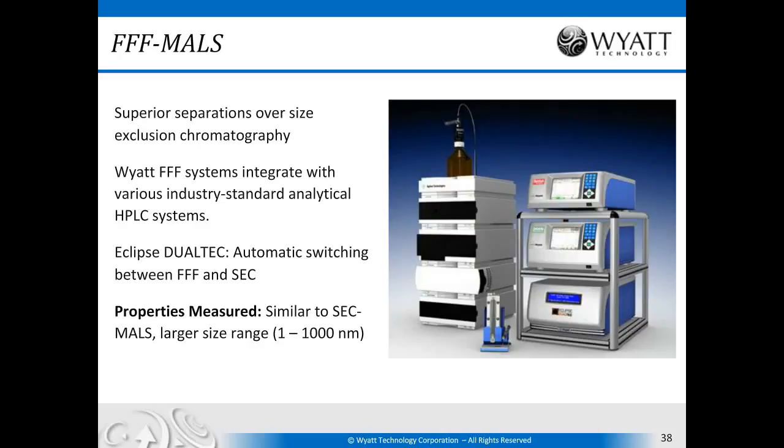The properties that you measure with FFF-MALS are similar to those that you measure with SEC-MALS, except you can cover a much larger size range. So you can measure a range of sizes from 1 to 1,000 nanometers.